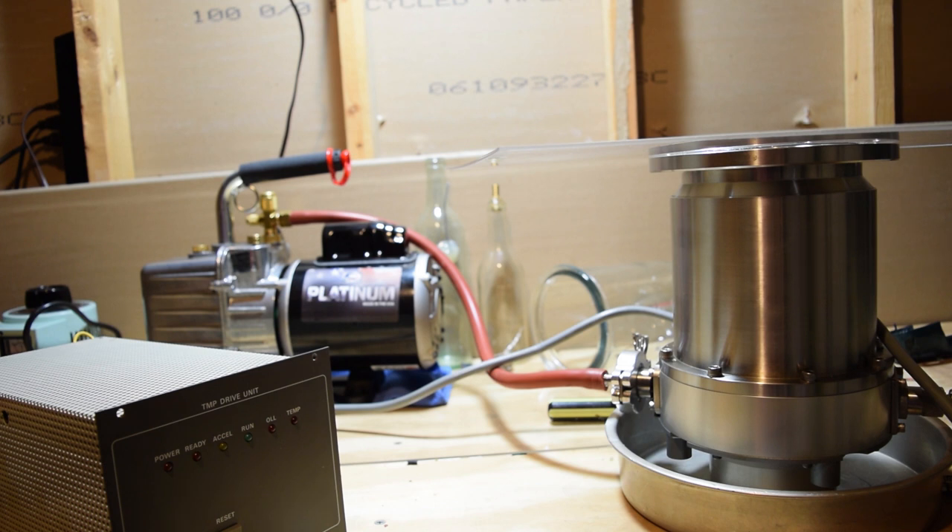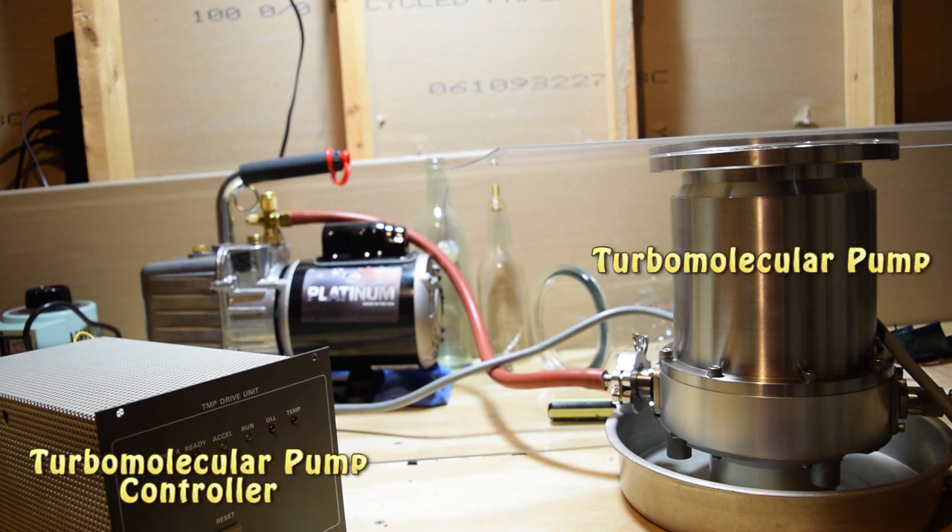Hey guys, this is GopherKingScience, and I want to show you guys a project that I've been working on for quite a while. I picked up this turbo molecular pump as well as a turbo molecular pump controller for it off of eBay, and I've been trying to get them to work.